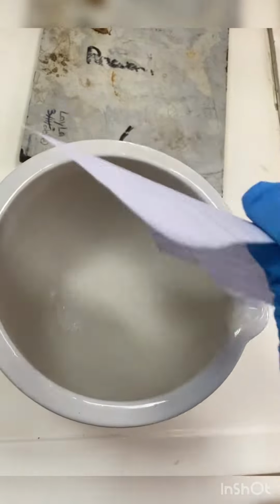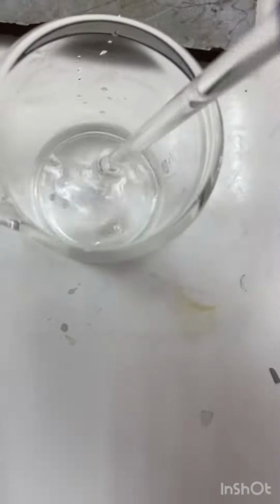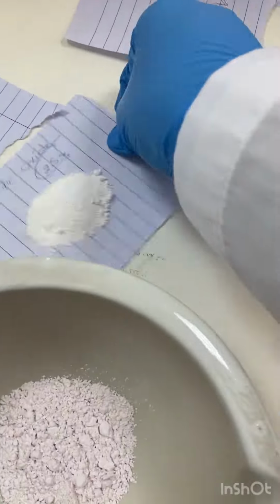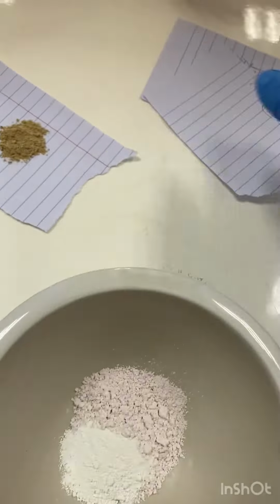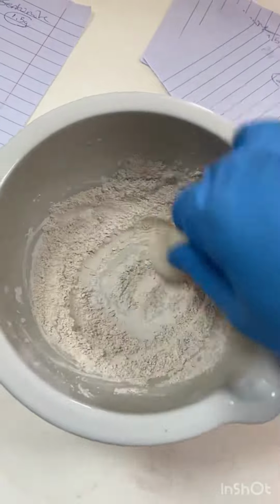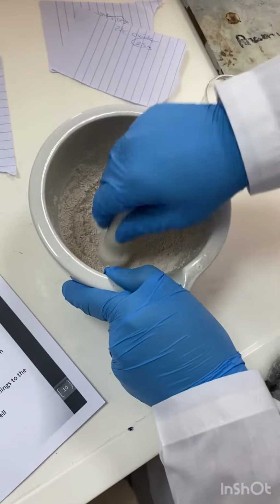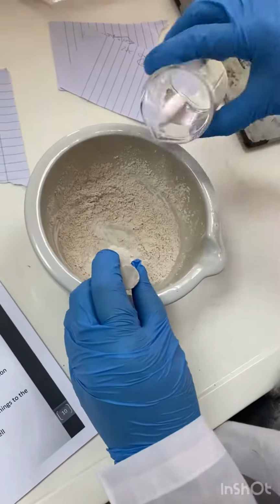Now we have to triturate the sodium citrate in a porcelain mortar, add it to a beaker, and dissolve it in 15 milliliters of water. After this, add all the materials, calamine, zinc oxide, and bentonite, into the porcelain mortar and start triturating to obtain finer particles. Then gradually add the sodium citrate solution into the fine particle mixture and mix well.